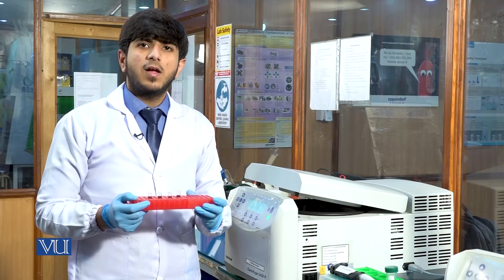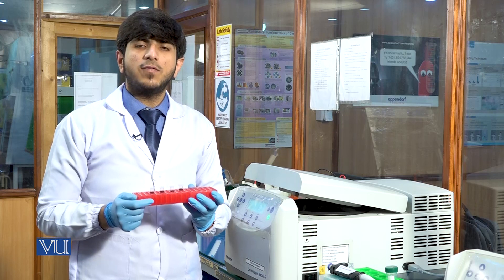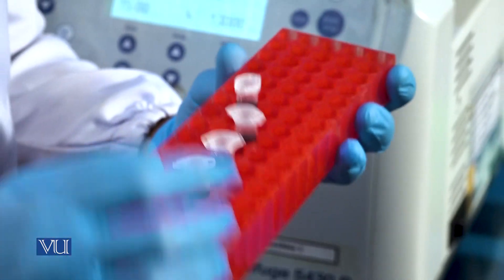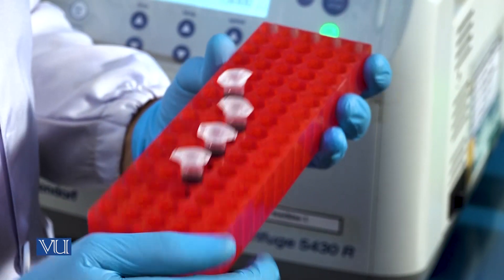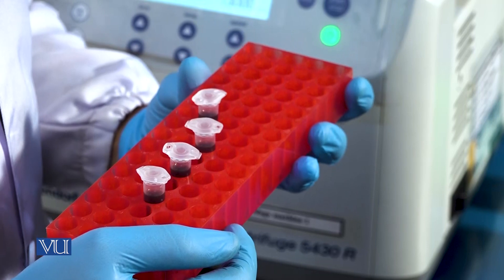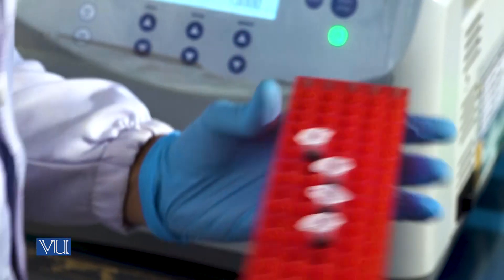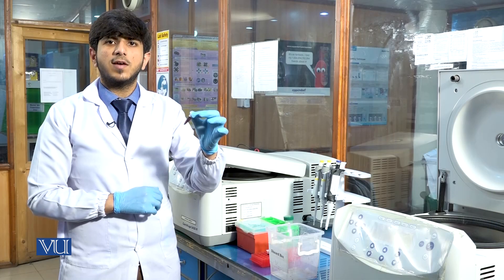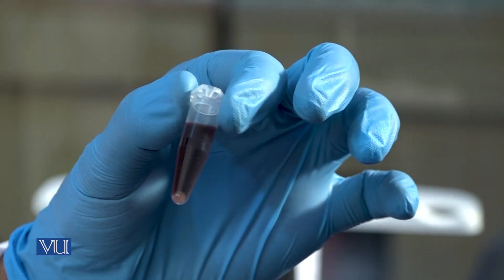After the first washing, we will discard the supernatant, and at the bottom of the tube we have a pellet which contains our DNA. The pellet is actually a collection of cells where the DNA is held. After these steps we will go for cell lysis through the digestion buffers. We will discard the supernatant, preserving the pellet.